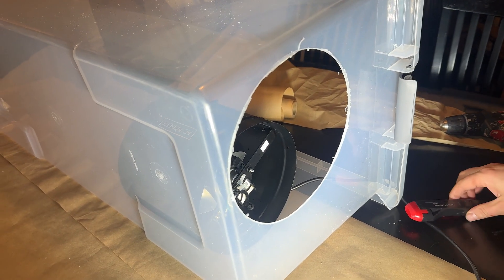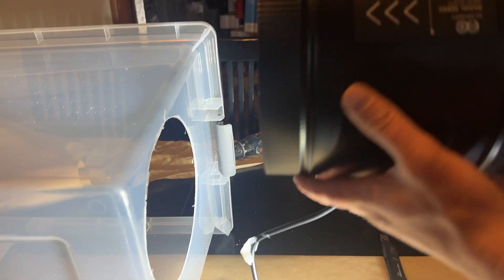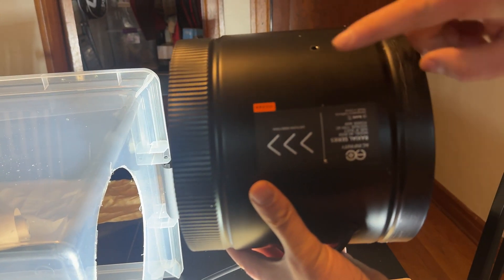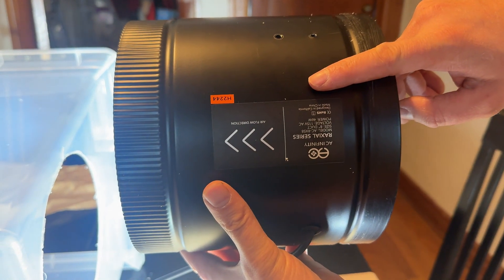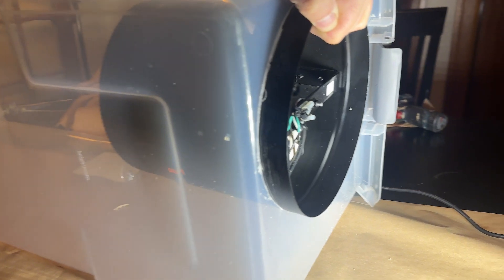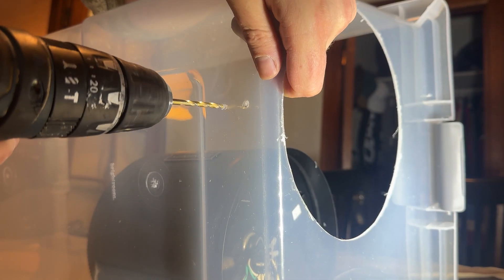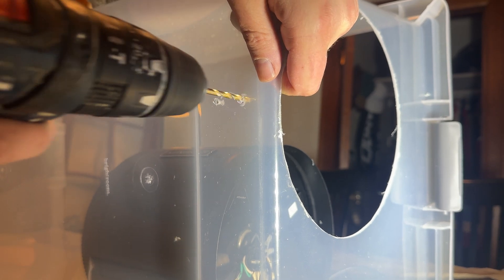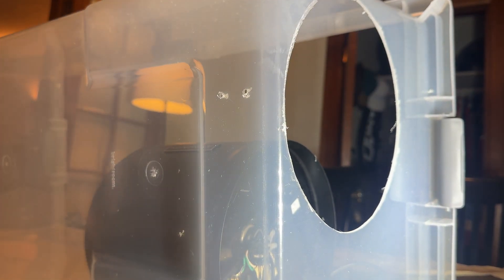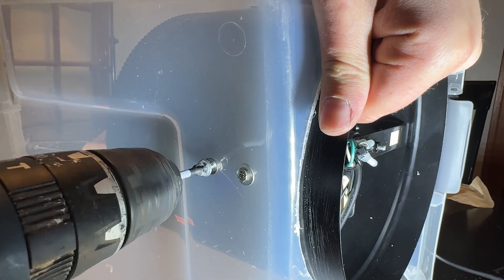Now we can put everything together. We'll start by installing the fan in the housing. Make sure that you orient the fan so that it blows air into the storage bin — this is indicated by the arrows on the fan housing. Mark the screw holes with the Sharpie, drill the holes into the storage bin, and secure the fan in place with the screws.